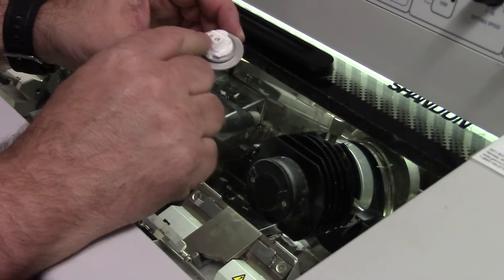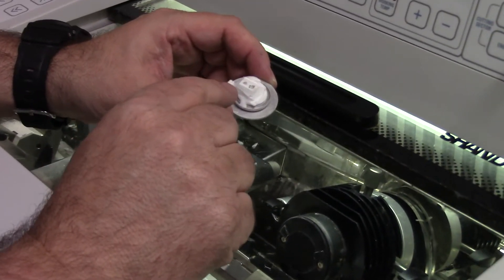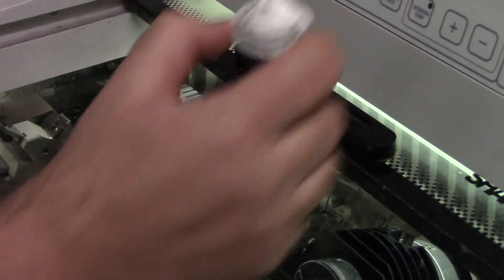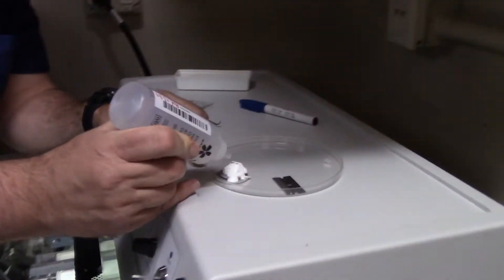Now what I want to do is make sure that this doesn't dehydrate as I put it in the freezer for however long until we finish sectioning. So what I'm going to do is grab the OCT from the fridge. Always good to have the OCT in the fridge.